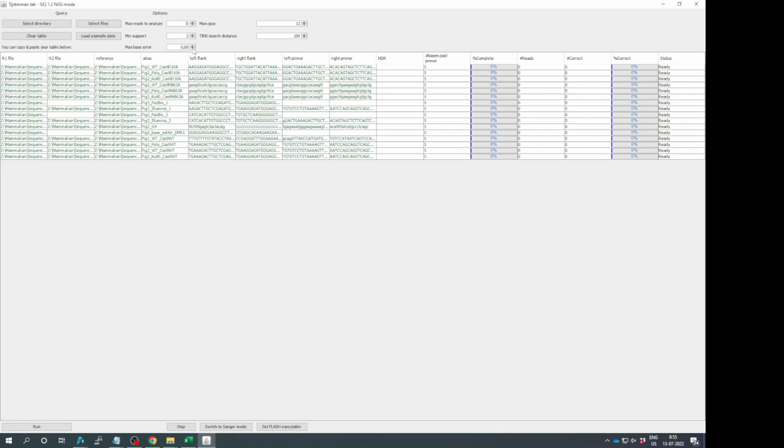If you set it lower, the chances are that you're including more sequencing errors, but you might get a richer repair profile. Whether or not that is a good idea, we usually, as a rule of thumb, say that if you do a few replicates, you will see whether or not such events are worth chasing, or if you see a genetic dependency. So you can play around with it, but the standard settings seem to work quite well.